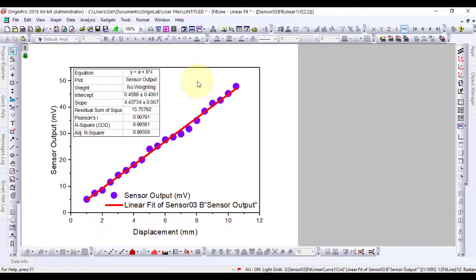This way, we can use the analysis template to have a uniform style of plots for large data files.